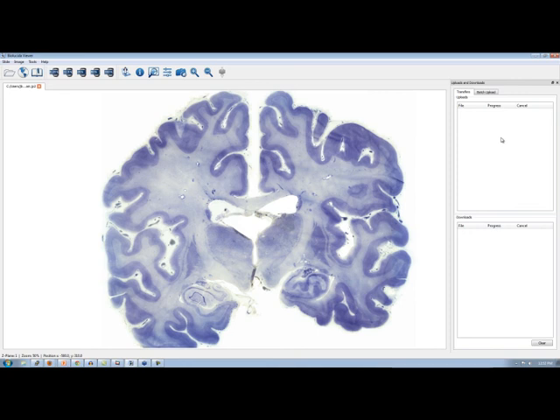So essentially, you can either upload images using the two methods in Biolucida Viewer like you demonstrated, or users can use standard networking approaches to add images to track directories in the cloud itself. Exactly. Are there any differences between those two that are pertinent to users? Basically two. I think there are two small differences you need to be aware of.